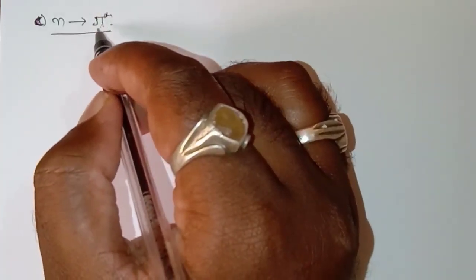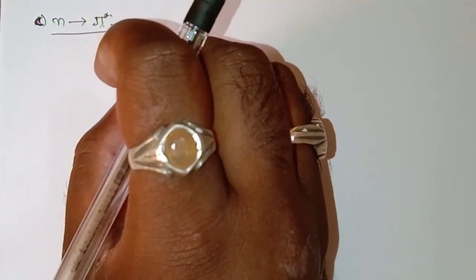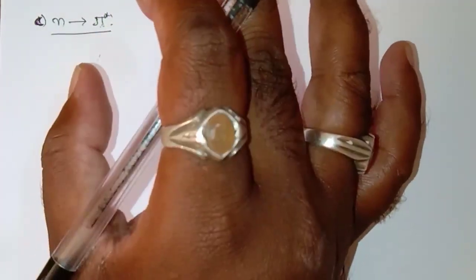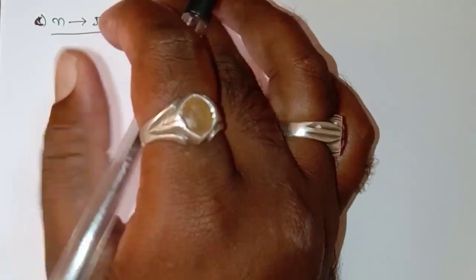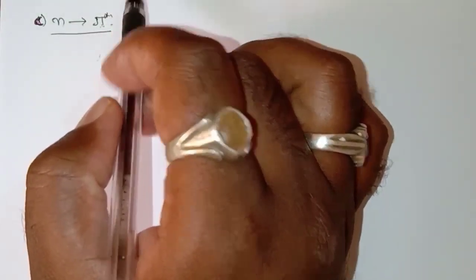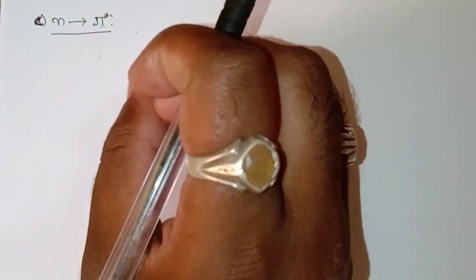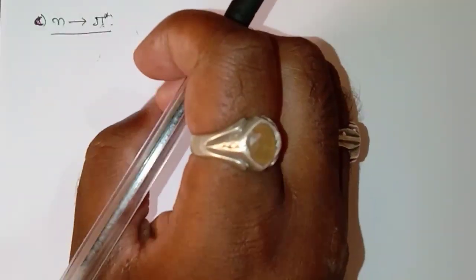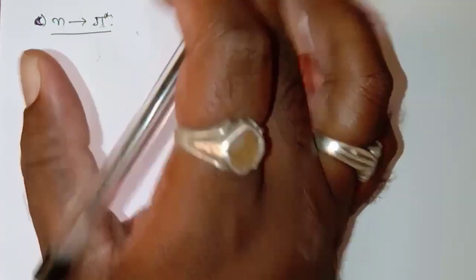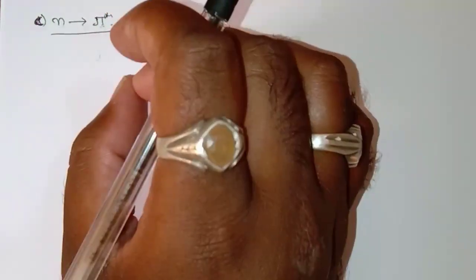In the n to pi star transition, the electrons of the unshared pair of electrons which are present on the heteroatom will take transition to the pi star, that is antibonding molecular orbitals. So the saturated aldehydes, having an unshared pair of electrons on the oxygen atom, will show n to pi star transitions, and this type of transition requires the least amount of energy out of all the transitions.